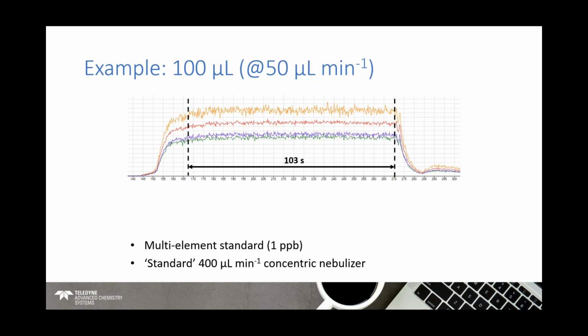We could have had multiple gas modes for overcoming polyatomic ion interferences, and going through this process, optimizing this and getting the flow rate right, we can realize the kind of data that we want from a low volume. So it takes me back to that question again of what data do I want from my sample, rather than what can I do with this tiny volume.